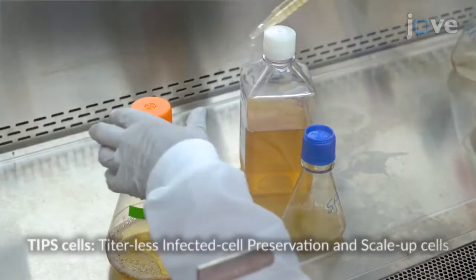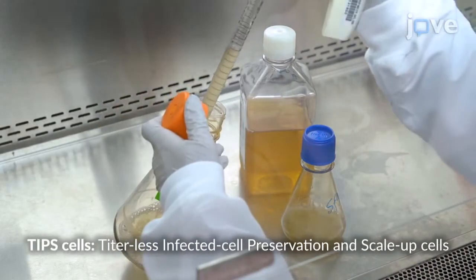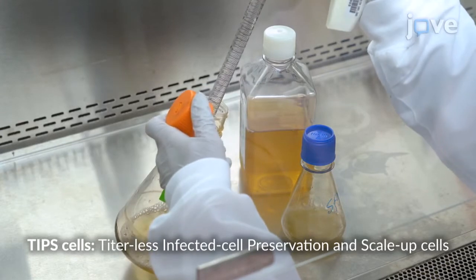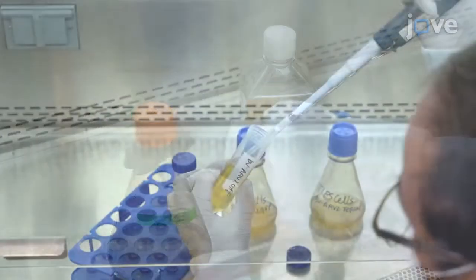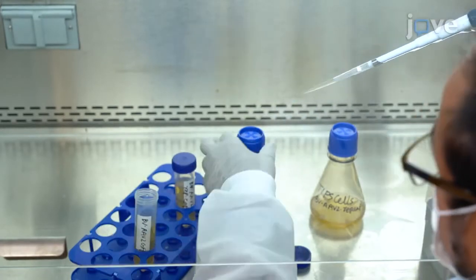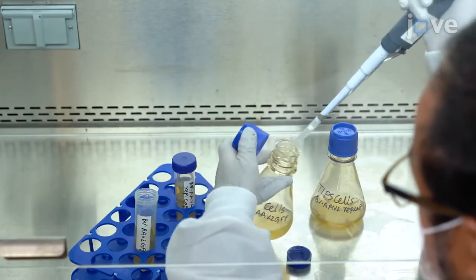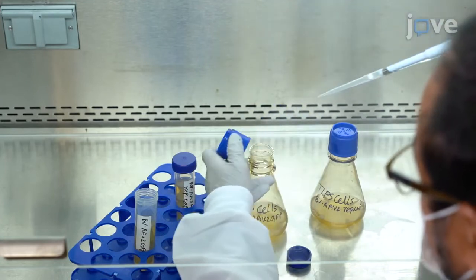Propagate the cells in a one liter flask containing 200 milliliters of medium to obtain enough cells for AAV production. Add 50 milliliters of SF9 cells at 2 times 10 to the sixth power cells per milliliter in two flasks.